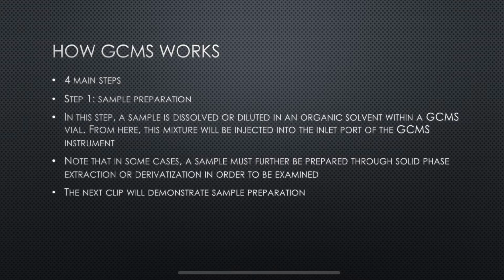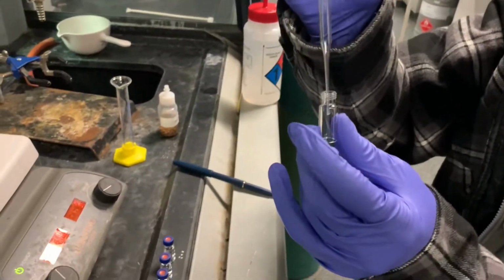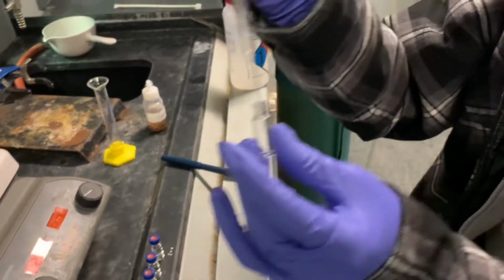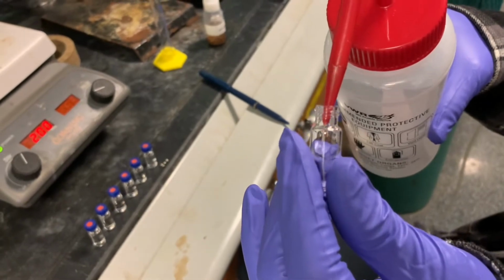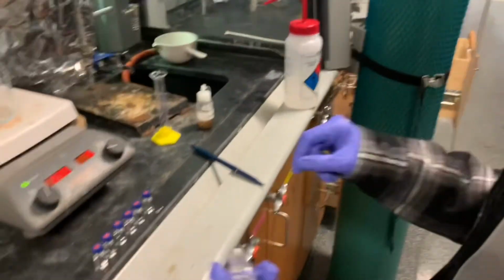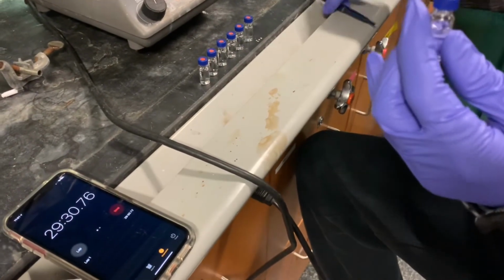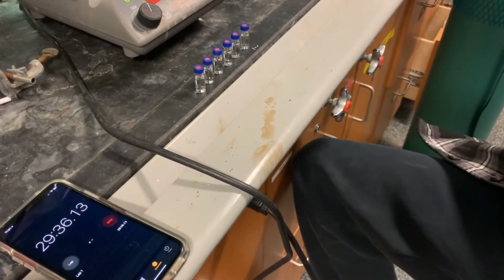In the next clip, I will demonstrate sample preparation. As you can see in this demonstration, I pick up my GC vial and use the capillary action of a glass pipette to drop a few drops of sample into the vial. Only a few drops of the sample are needed because the GCMS instrument is very sensitive and any more could damage it. After doing so, I filled the rest of the vial 2/3 of the way full with the organic solvent acetone. Once done, I relatively tightly cap the vial and I make sure that it and all of my other vials are labeled with the time point that they were taken and are ordered correctly.